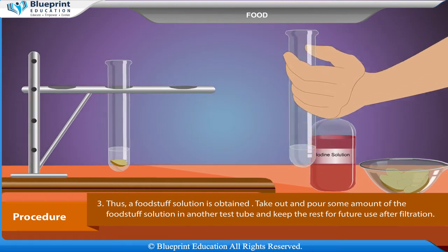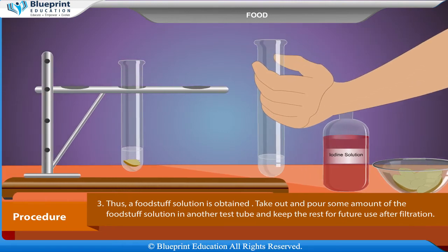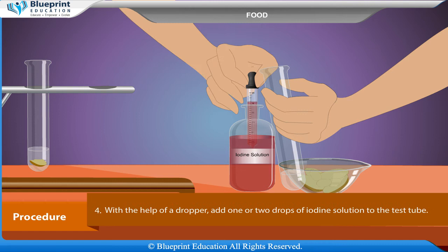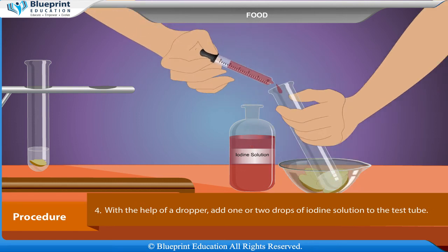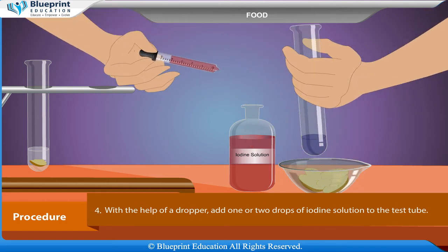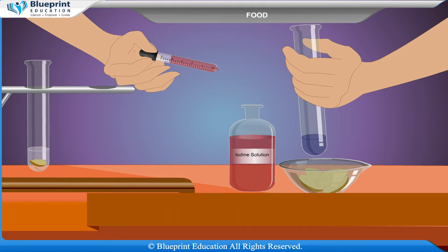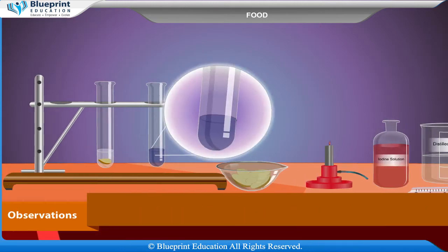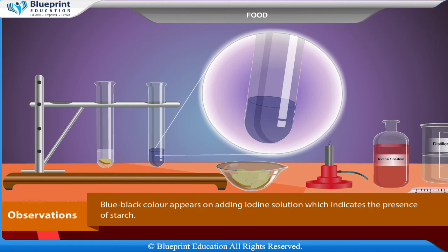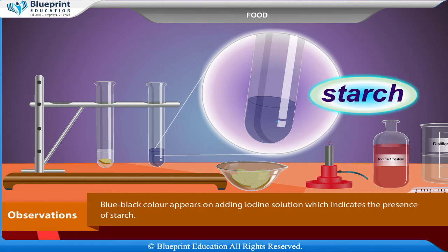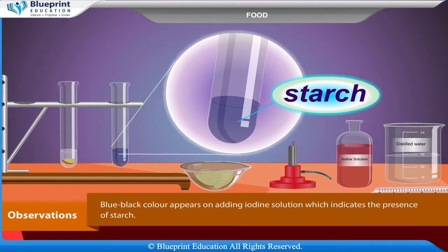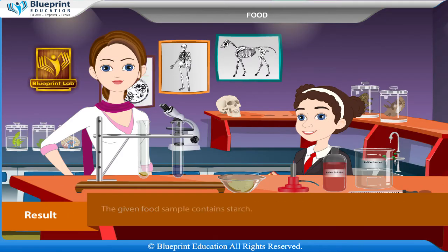Take out and pour some amount of the food stuff solution into another test tube and keep the rest for future use. After filtration, with the help of a dropper, add one or two drops of iodine solution to the test tube. Observation: a blue-black color appears on adding iodine solution, which indicates the presence of starch.